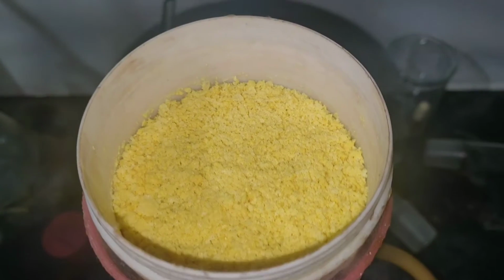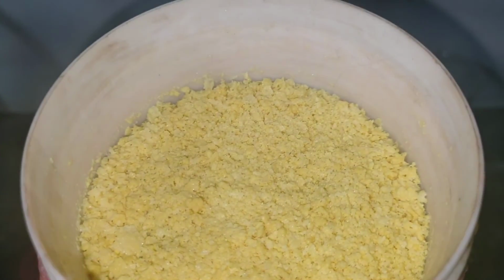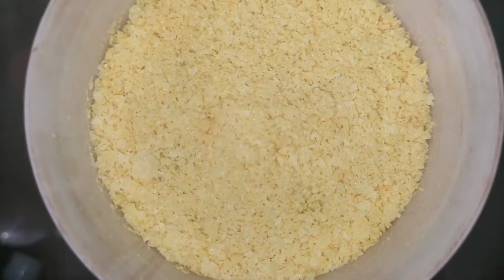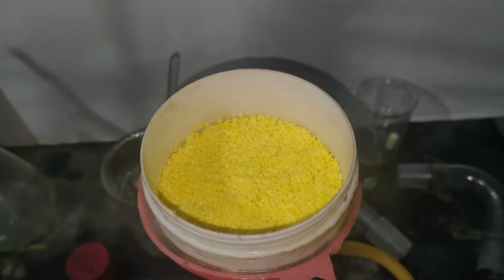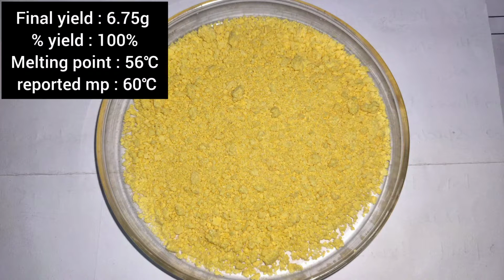This is the crude alpha-nitronaphthalene. The final yield of crude alpha-nitronaphthalene after drying came to be 6.75 grams, which corresponds to a percentage yield of 100%. I also measured its melting point and it came around 56 degrees Celsius, which is very close to the reported melting point of 60 degrees Celsius.